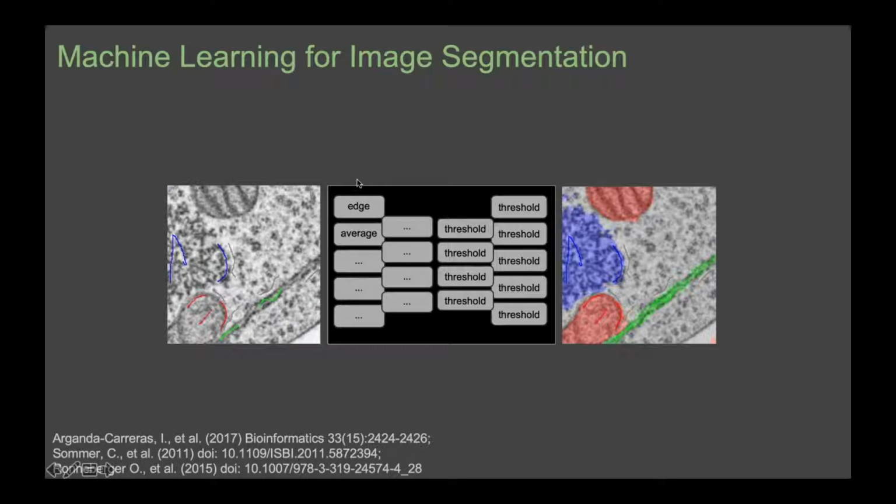And then the computer will compute many, many different filters, like the ones we learned, for example, the edge, the average, maybe a top hat, many of them, and then automatically tries these filters or even combinations of these filters to see how to arrange them and what thresholds to use to reproduce your annotation. So the computer is basically doing all that, trying out different filters for you.